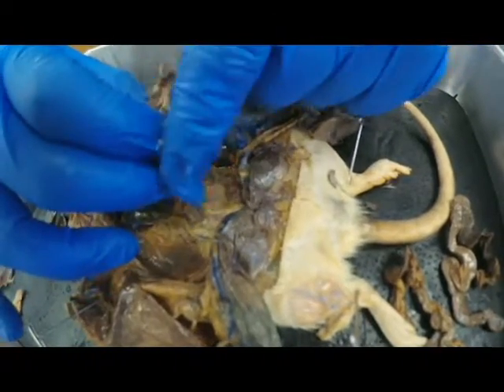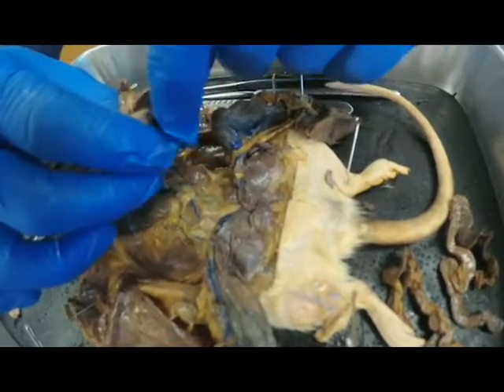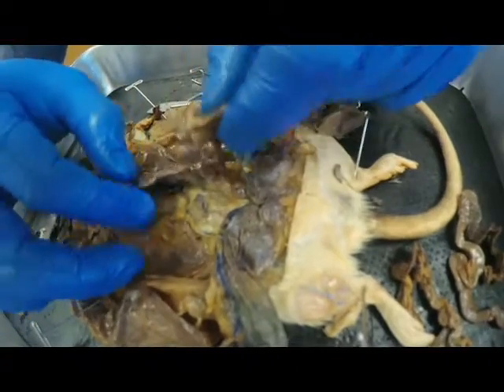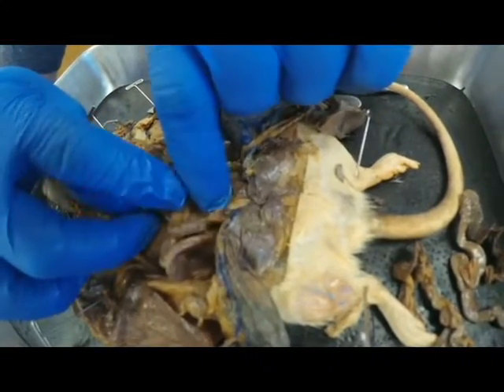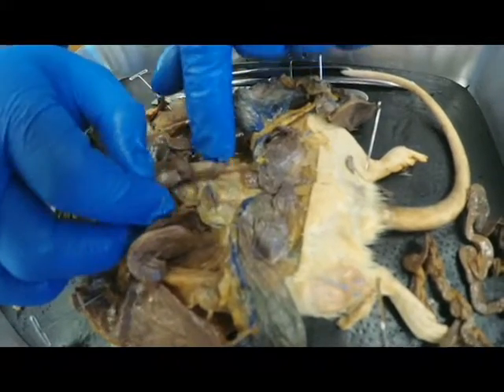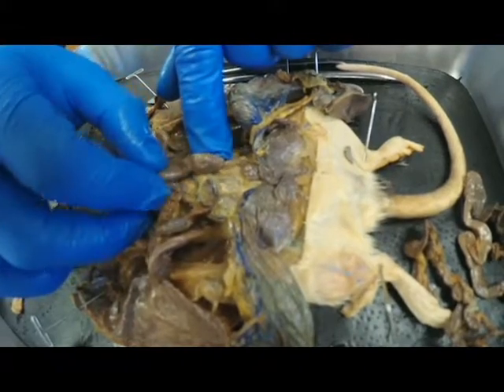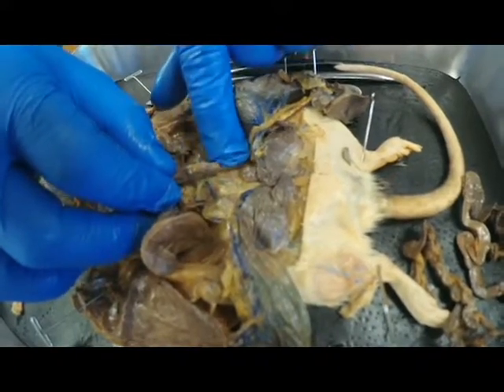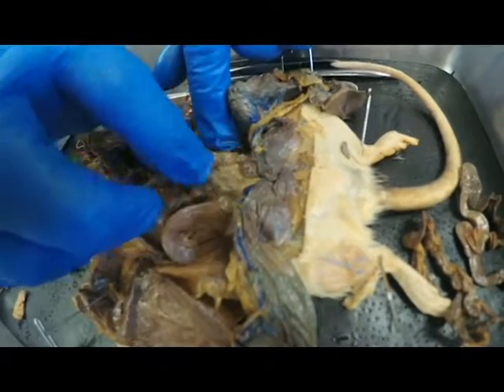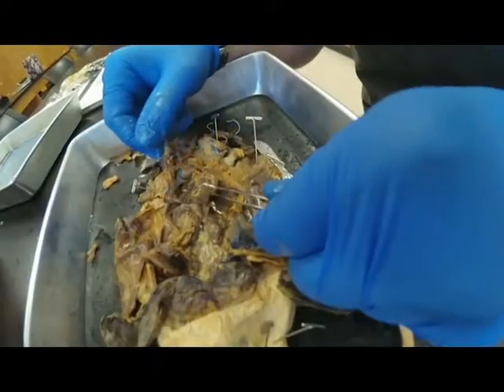Then after the bile and food goes through the cecum, it goes into the large intestines, which is this right here. The large intestines is mainly used for more breakdown of the food, and it is large. You can see how it has these lumps. That's food, basically, and waste. And then it'll move into the rectum and out the anus of the rat.